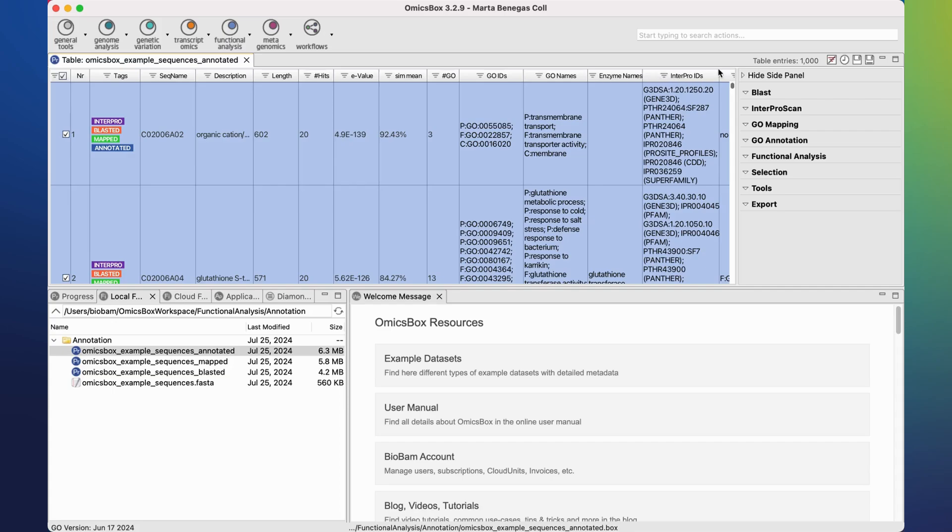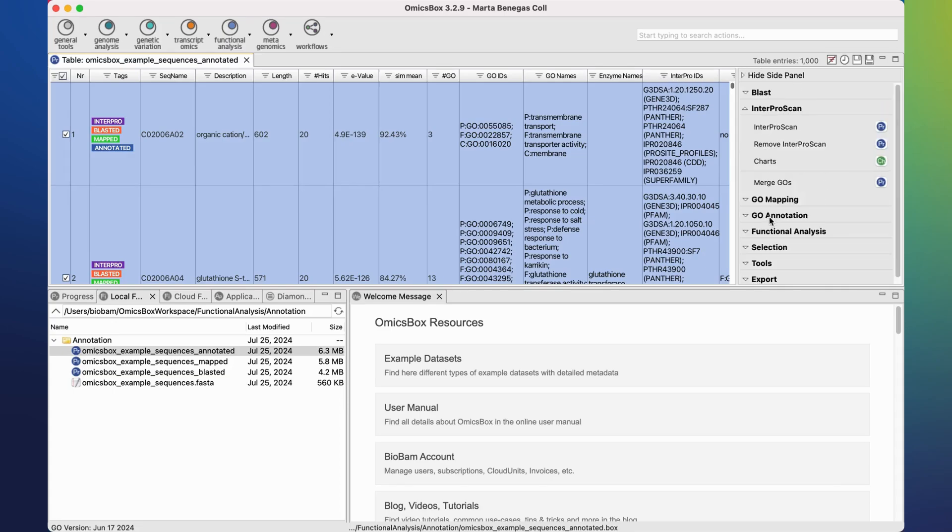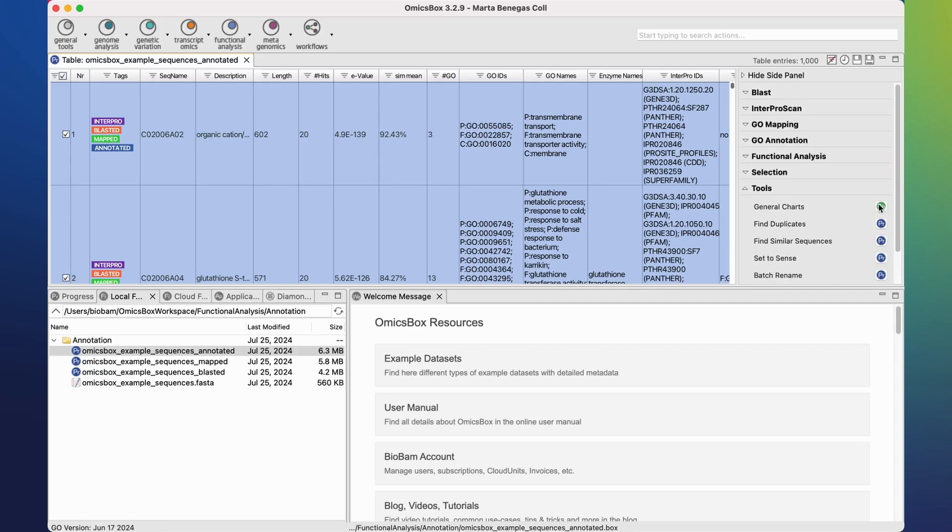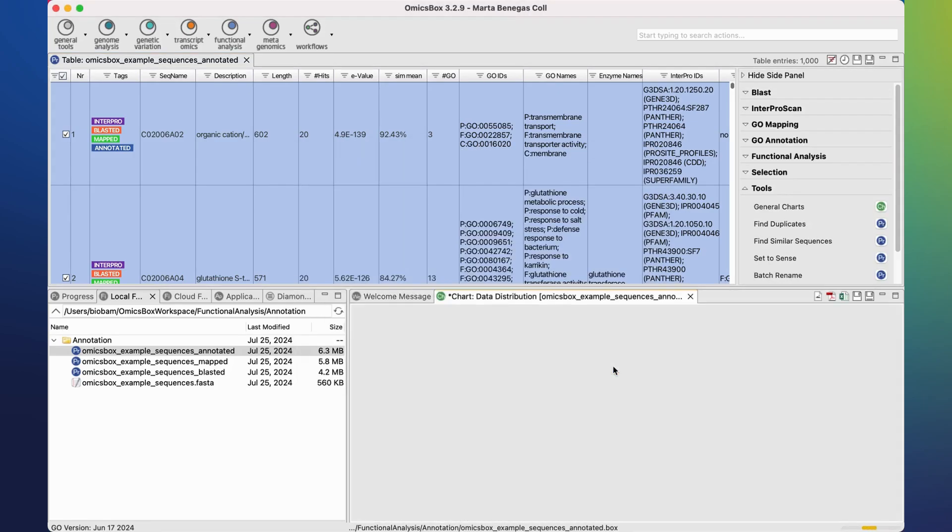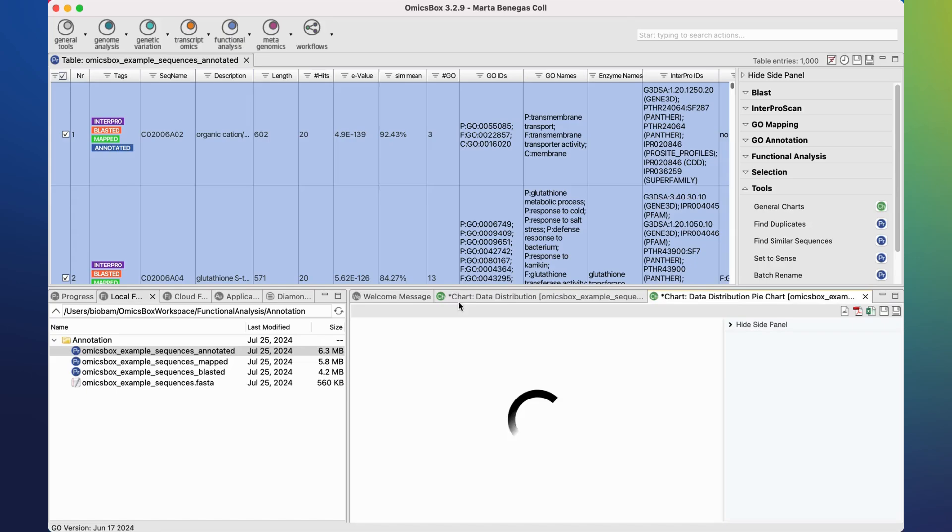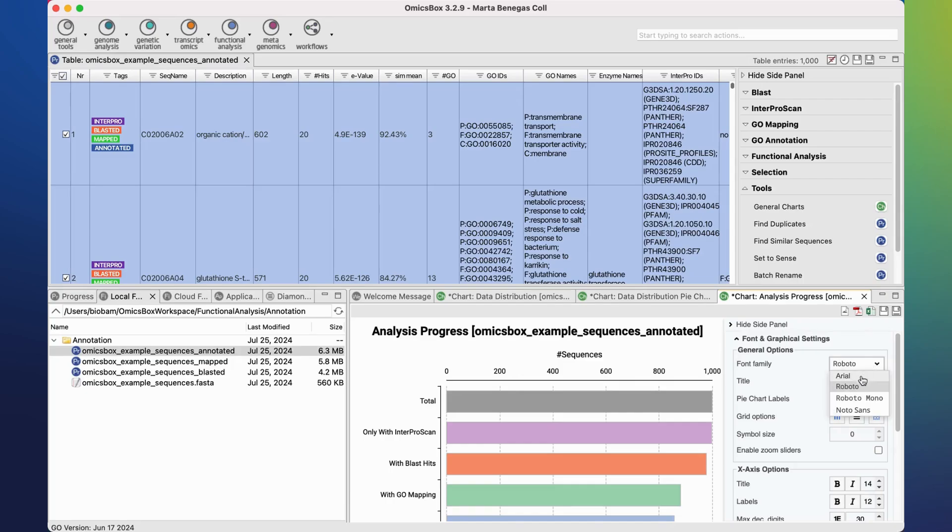On the side panel we have different downstream analyses that can be applied to the results, as well as different charts. The charts will be opened in this viewer and they also have a side panel in order to adjust their appearance.